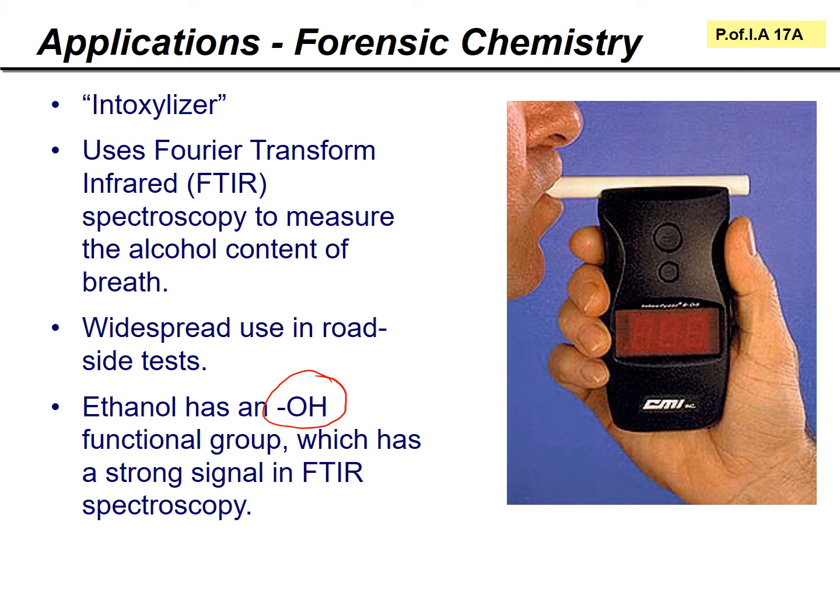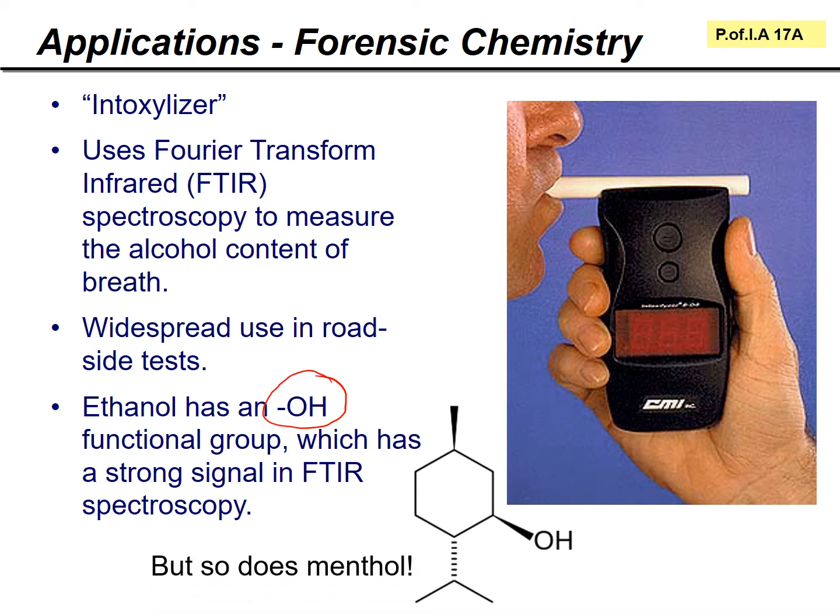Now, it's an interesting question as to how specific this is. I mean, plenty of compounds have a strong OH absorption. Here's one, menthol. This turns up in cough drops. Look at that. So, don't want to give you any ideas, but next time, if it's not looking good, you could always try and argue with the nice police officer that menthol contains an OH functional group, and as luck would have it, you'd just eaten 16 packets of menthol cough lollies. Good luck with that.